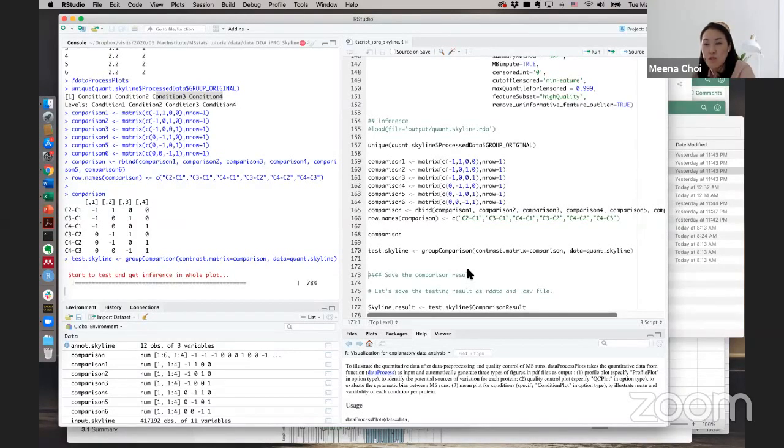The issue column means we flag it. For example, the object's p-value is zero, but that is because we suspect something happened: one condition is completely missing. So we mark that one condition is completely missing, and that is why we cannot calculate the p-value. However, we check the direction, so the log fold change might be infinity or minus infinity. Based on the plus or minus direction, you can see which condition has a value and which doesn't. We mark this, and we also recommend listing this kind of protein separately.